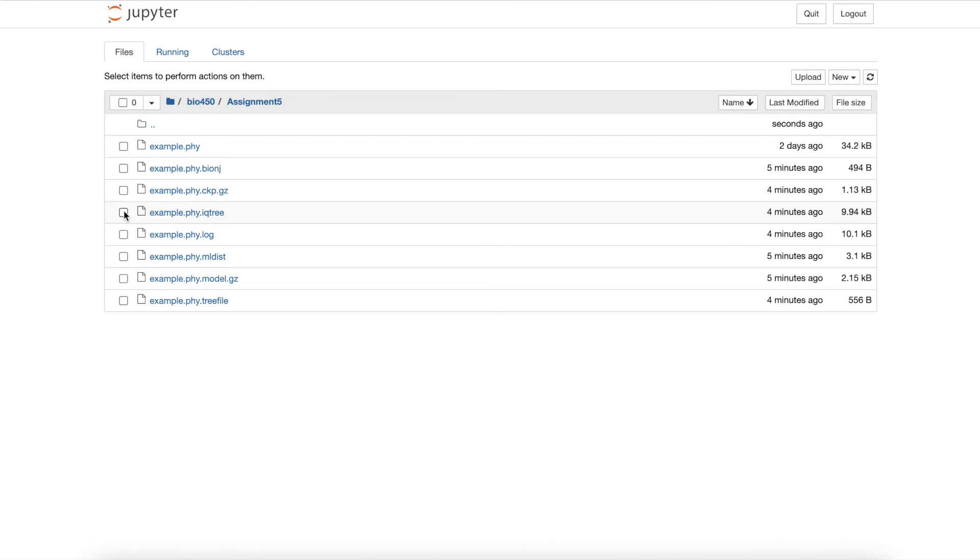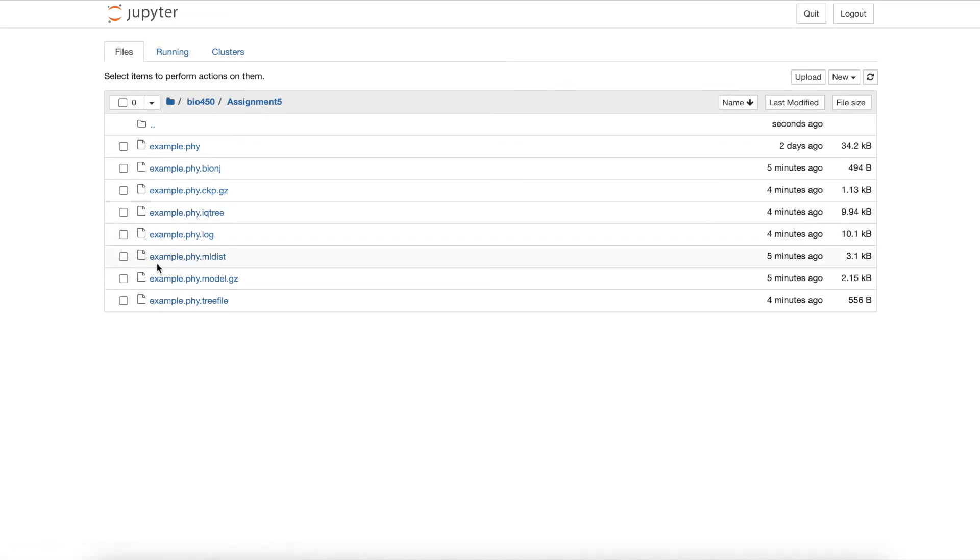When you run the command, your output files will have the same tags at the end, but instead of example.phy at the beginning, it will be your personalized input file name. These other files contain coded interpretations and logs of the entire run.